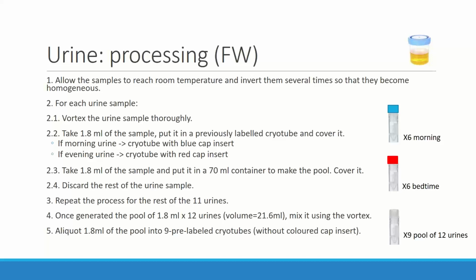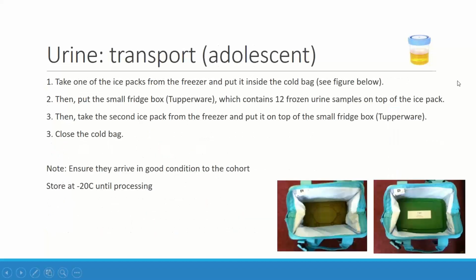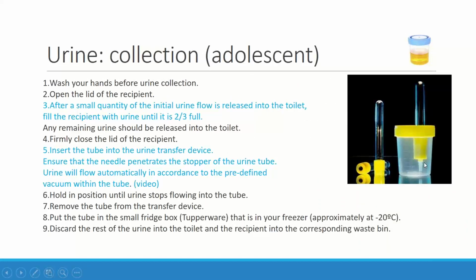I think this is... Mariana, I have a question from Norway, Amrit. I just want to know these recipient tubes and the other tubes, what kind of plastic, and if they contain any additive added to them? Which ones? These ones to make the pool, or the ones for the collection? No, the first one for the collection. These ones. Yeah.